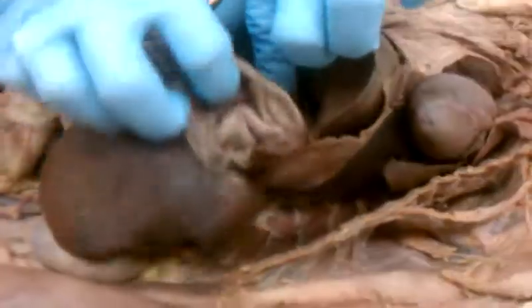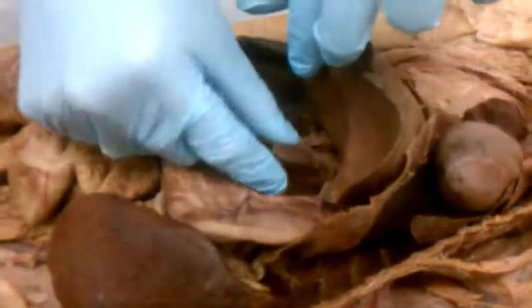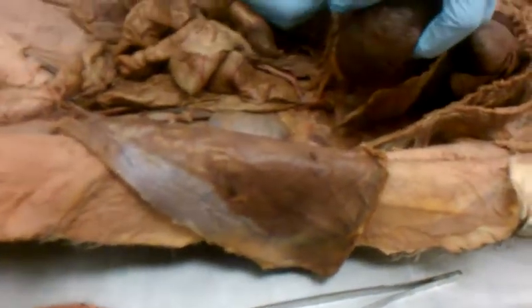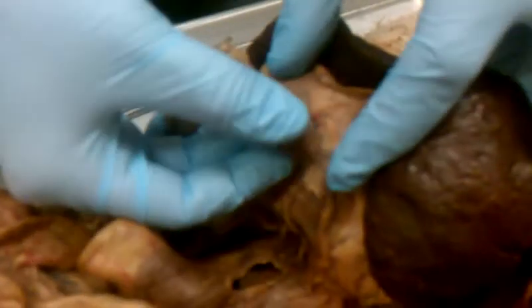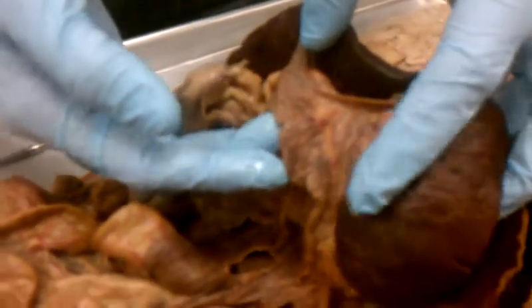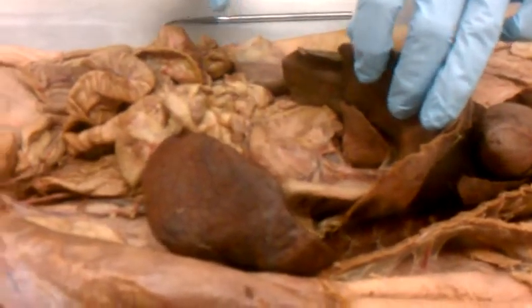And underneath there, you have your pancreas, which is, here it is. There's your pancreas. That thing. That's not the stomach? No. This is okay. More than likely, y'all, I want to ask you pancreas. Just so y'all know.